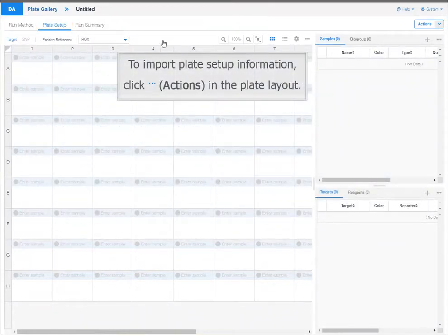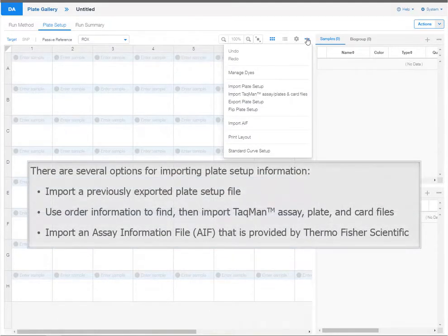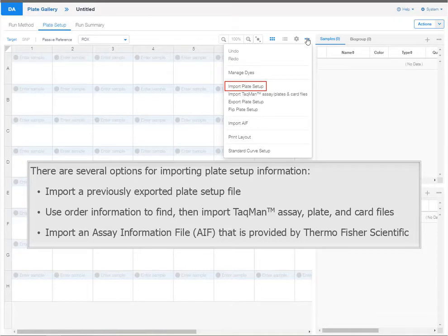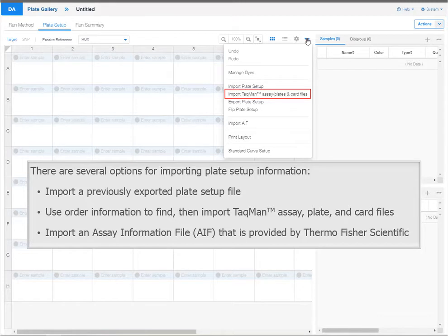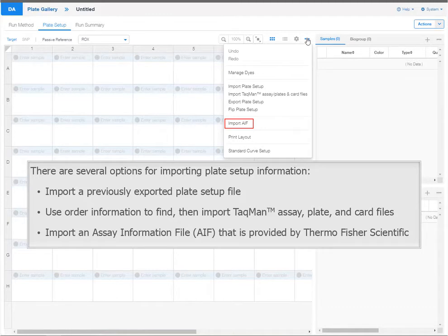To import plate setup information, click Actions in the plate layout. There are several options for importing plate setup information. You can import a previously exported plate setup file, use order information to find then import TACMAN assay, plate, and card files, or import an assay information file that is provided by Thermo Fisher Scientific.